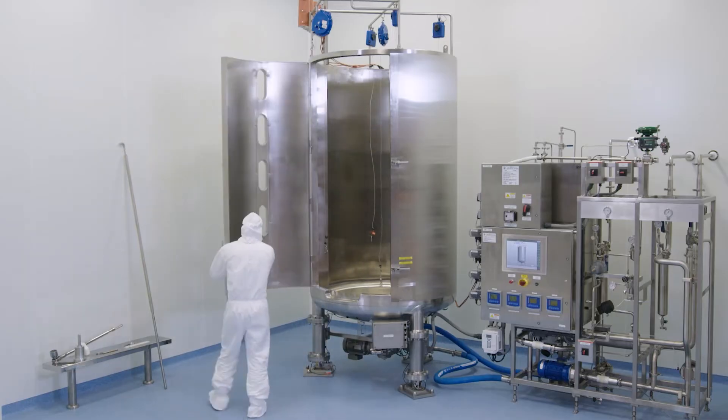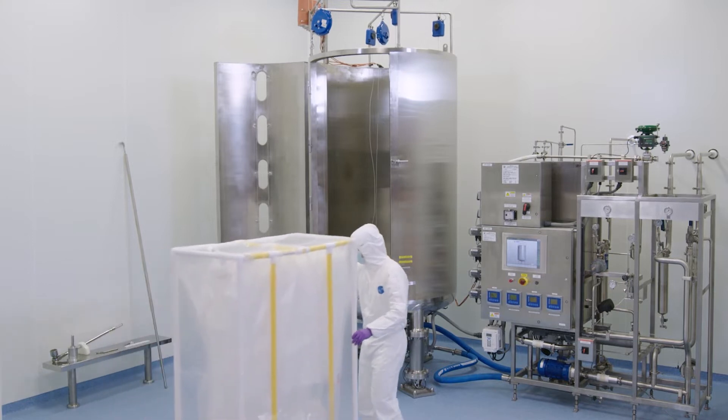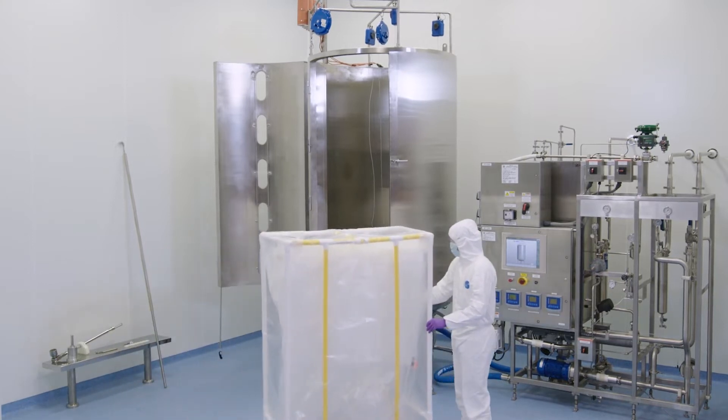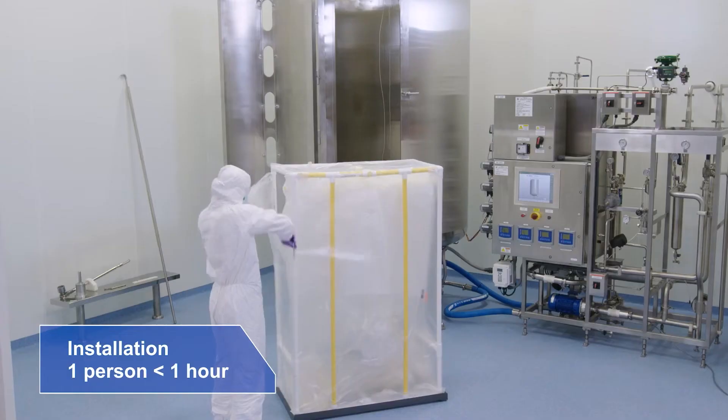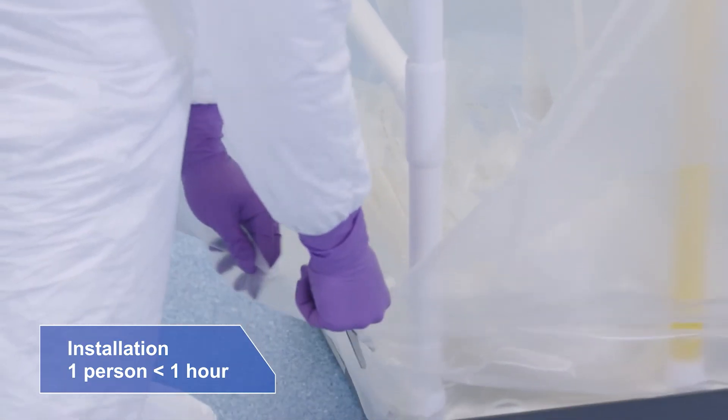Once the CSR disposable container reaches the equipment, installation is easy and fast. This 4,000-liter disposable container can be installed by one person in less than one hour.